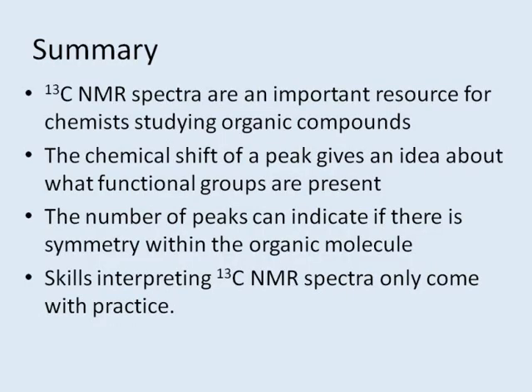We have now covered basic interpretation of carbon-13 NMR spectra for simple organic compounds. To summarize, carbon-13 NMR spectra are an important resource for chemists studying organic compounds. The chemical shift of a peak gives an idea about what functional groups are present, while the number of peaks can indicate if there is symmetry within the organic molecule. Finally, skills interpreting carbon-13 NMR spectra only come with practice.